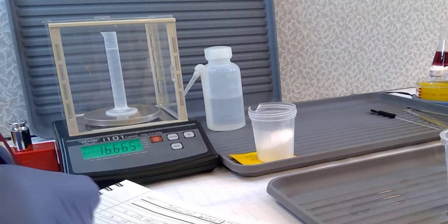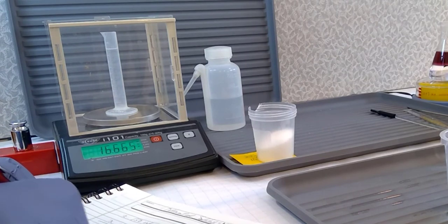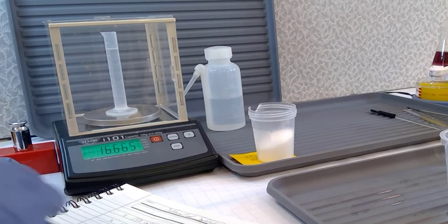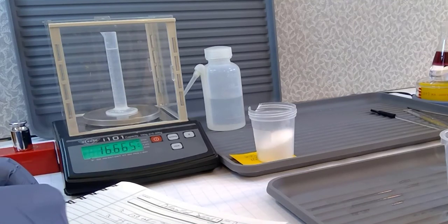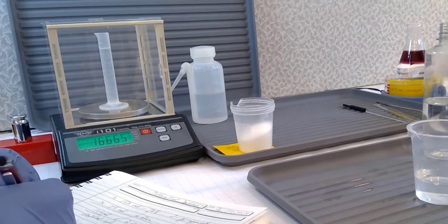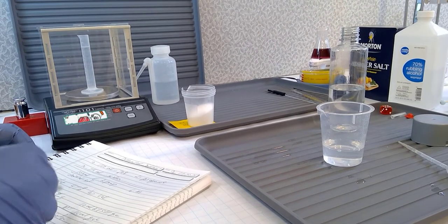And our mass is 16.665 grams. Read that again, 16.665 grams. And I can find out my grams of solution. I can do the subtraction if I wanted here. I'll double check.